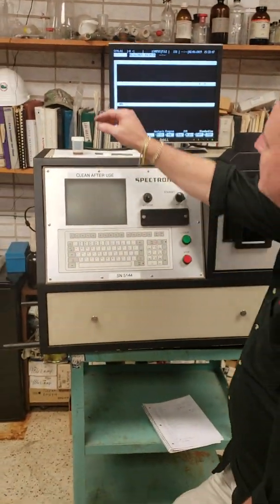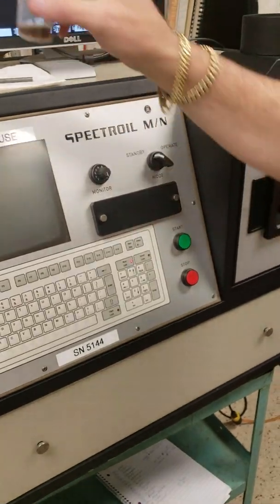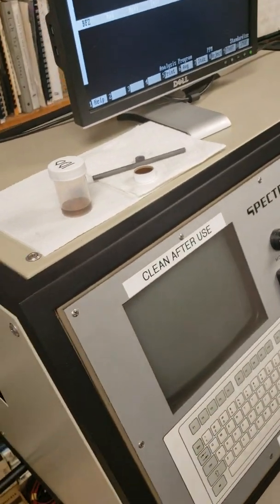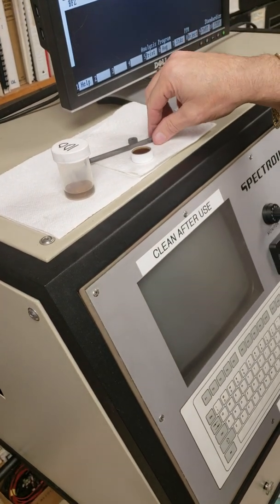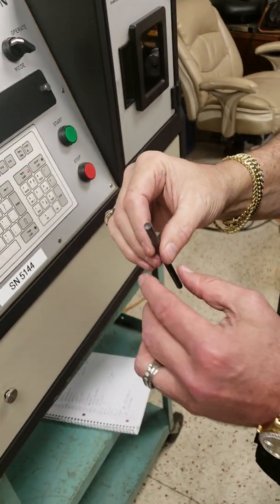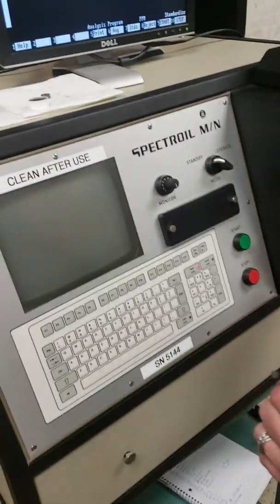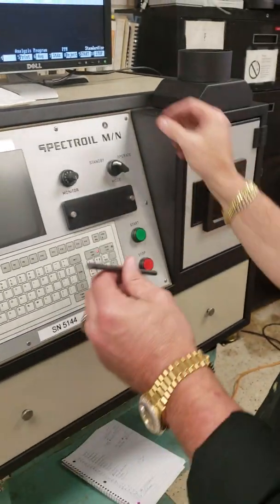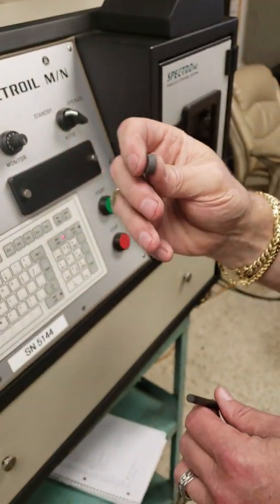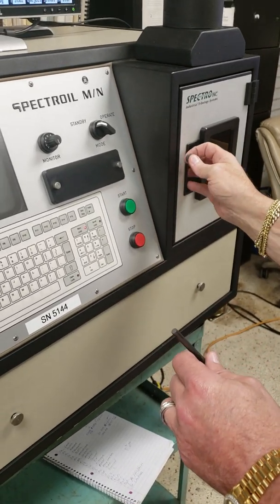We've got a standard here that's 100 parts per million of all these elements. We're going to get these rods — you can see they're rounded at the end. You can get these from Bay Carbon. You get a rod and a little disc. These discs are single-time use; the rods are multi-time use.